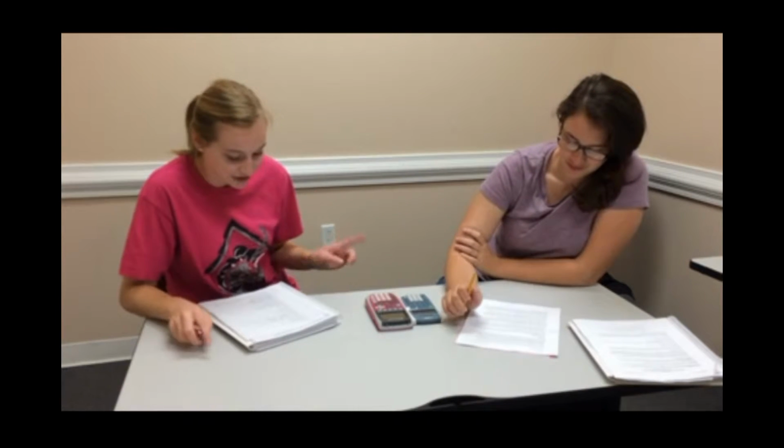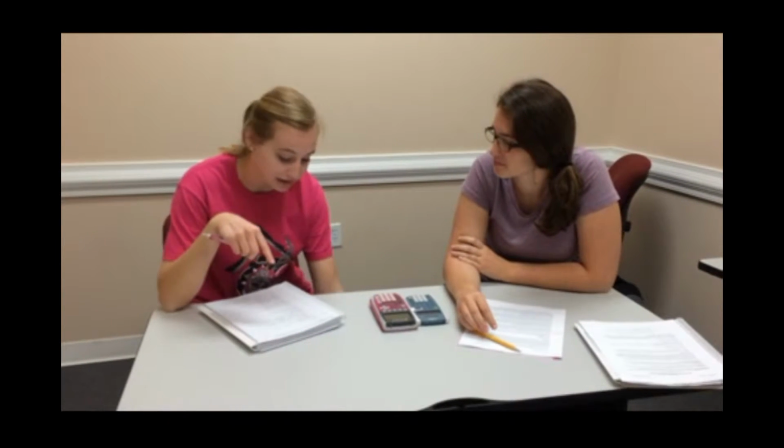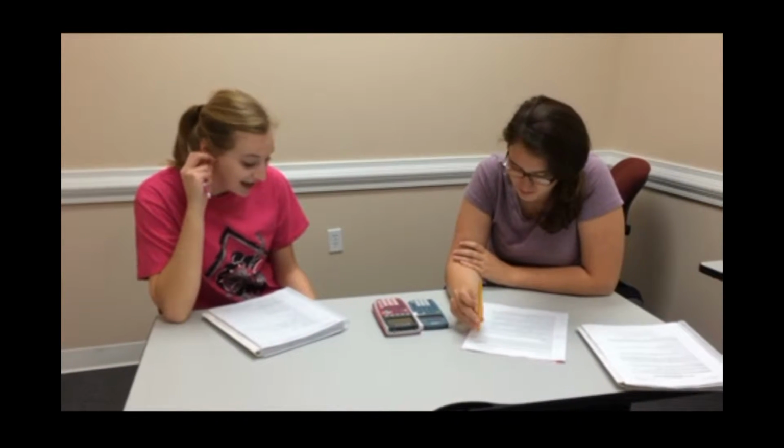Like, how do we even do this experiment? How do we even start? Well, first we have to weigh the beaker, then we weigh the beaker with zinc in it. Then we weigh paper, measure out iodine and put it on the paper, and weigh them both together. Then we add acetic acid to the beaker with zinc in it. Then we swirl the beaker until it becomes colorless. Then we decant the solution into a beaker, add acetic acid to the beaker with solid zinc, wash the zinc, dry the zinc, heat the moist zinc, heat again, and then weigh the remaining zinc.